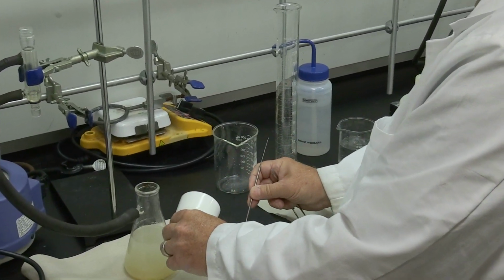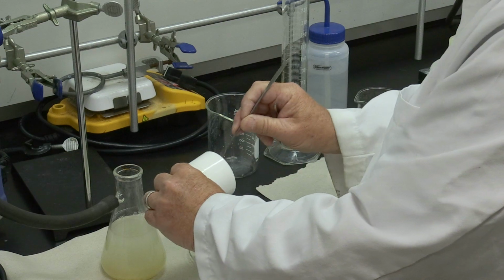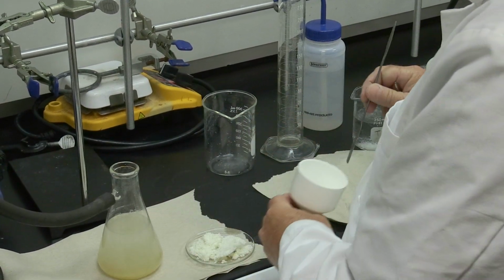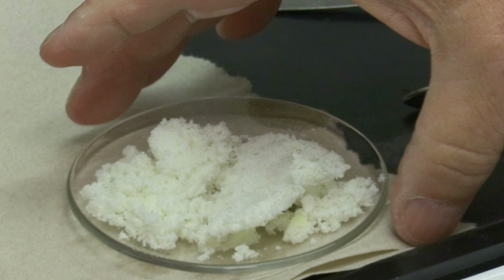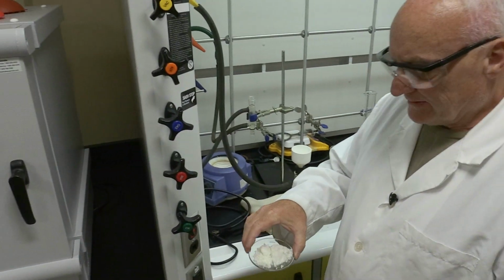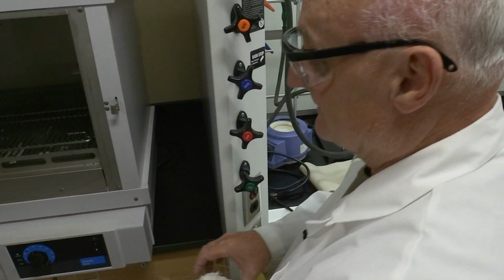We've got a lot of product. It's still wet, but we'll dry it for a while in the oven and get our weights and calculate the yield. This is at a reduced temperature of around 60 degrees. As it melts about 70, 74.